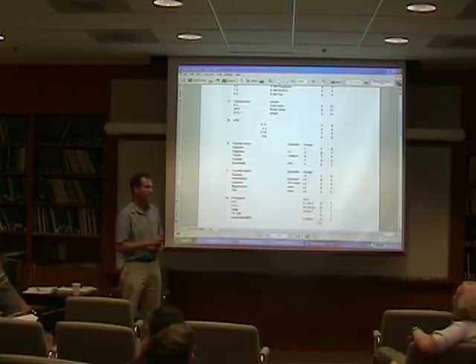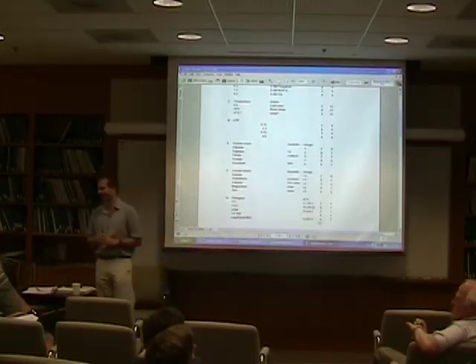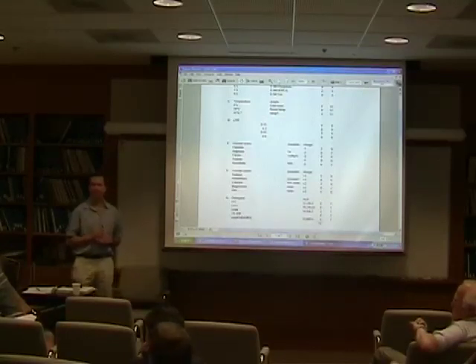So some other idea that I would like to throw up. Thomas Braun and Basis started always to pool two samples on one grid, and then you have only to check half as many grids. And if you find crystals, then you go back to both samples and check which one it was. If it's just precipitation in the beginning, then instead of 33 samples, you only look at 16. Could you put 10 samples on a grid?